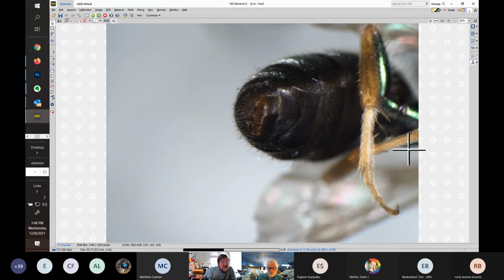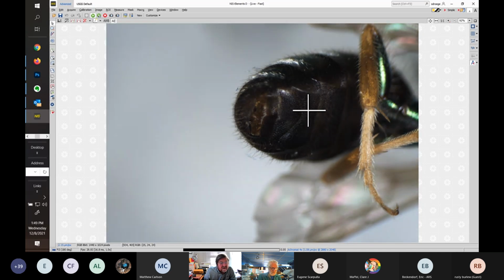It's just sometimes legs are broken off. So you can, there you go, that's classic. You can see that right there. That's strong. You know, rarely will you see an aurata that looks like that.